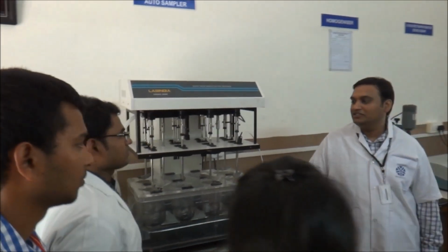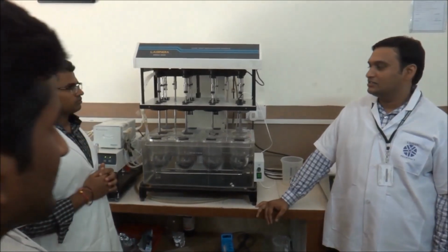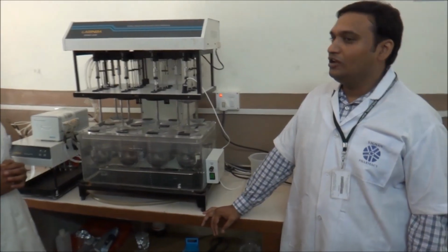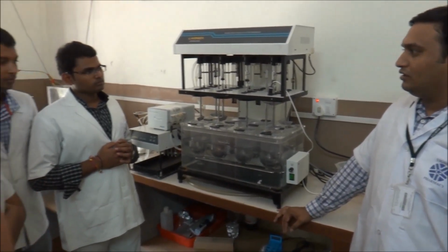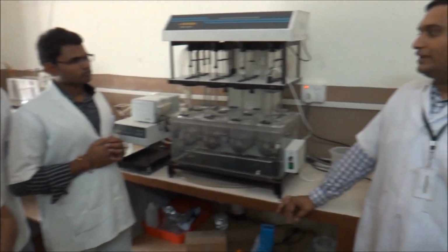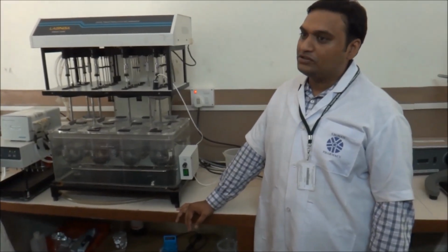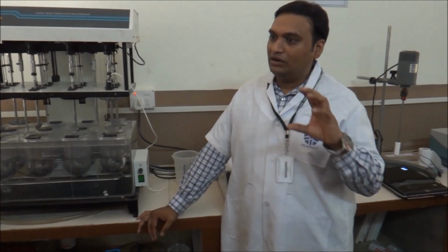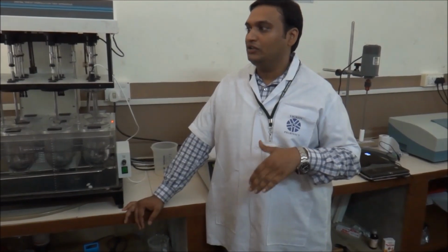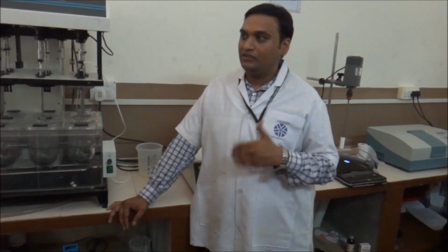So today we are going to discuss the dissolution apparatus, its importance, its operation manual and the standard operating procedures. As you all know, dissolution is a very important parameter when it comes to solid dosage forms, especially tablets, capsules and powder dosage forms. Dissolution is the process of movement of drug from a tablet dosage form into the bulk of the solution. This phenomenon is going to influence the rate of absorption. Therefore, prior to the rate of absorption, the rate of dissolution is highly essential.